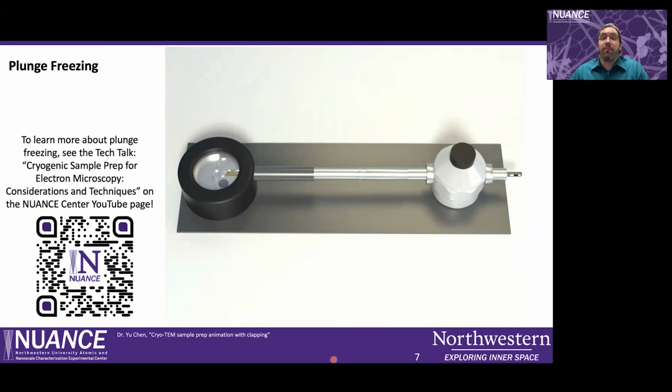The downsides are that plunge freezing cryo-TEM is a technique where you really have to practice all of the soft skills a lot. These particular grid transfer changes in and out of the cryogenic phases take a lot of practice. So we are very happy to train you in how to do this. We're also very happy to do it for you. And if you want more details about this, we have a prior tech talk here at this QR code that you can watch and really learn more about that.